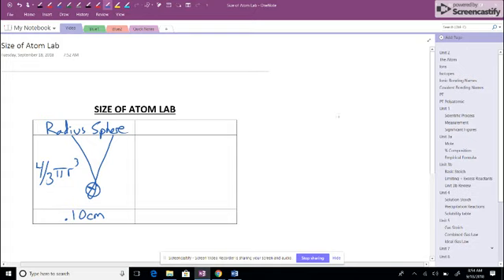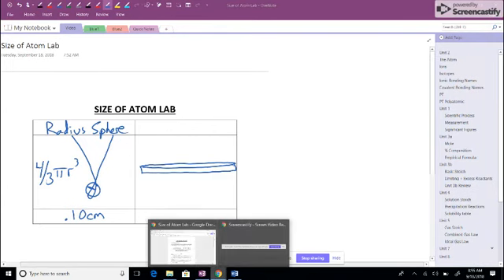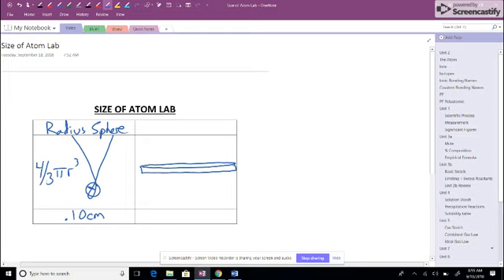So what I did is I put this oil drop in a tray filled with water and sprinkled with this tiny powder. And when I put the drop in there, this sphere spreads out as far as possible into this layer that is about 1 molecule thick. And if you want to know what that molecule was, the oil we were using was oleic acid. So this molecule, we can assume that it's being flipped, so it's going up and down vertically there in this water.